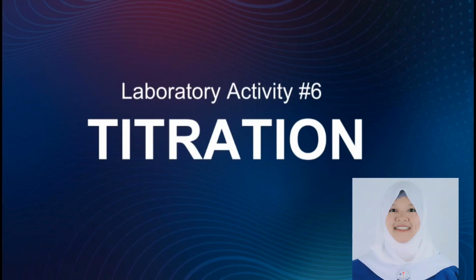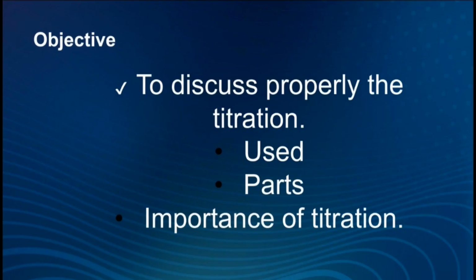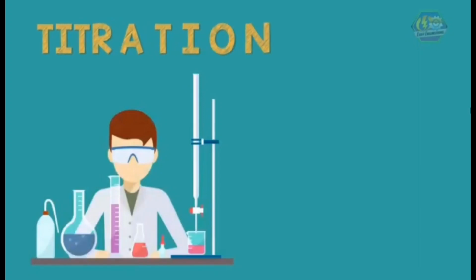So for today's video, I'll be presenting my laboratory activity number 6, which is titration. First, let me state my objectives for this presentation. My objective is to discuss properly the titration, the use, the parts and importance of titration in chemistry. Let's define first what is titration.